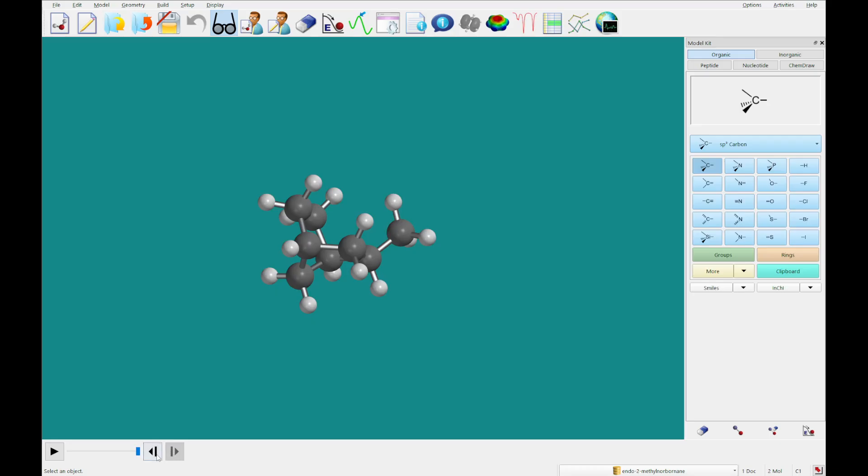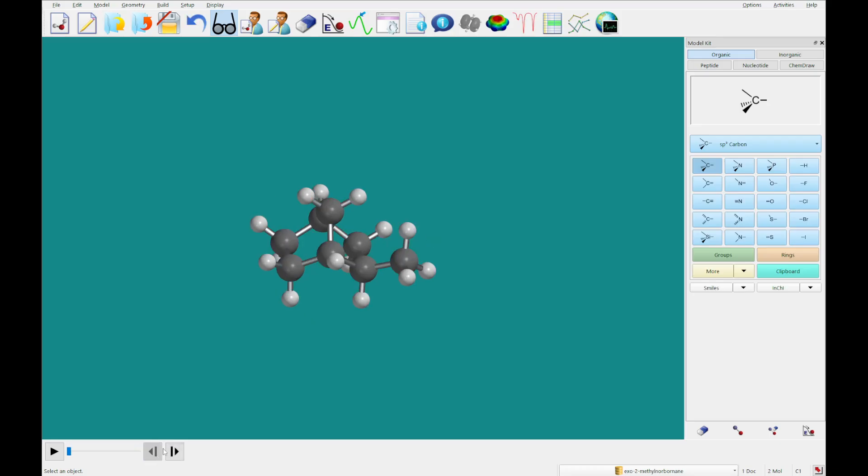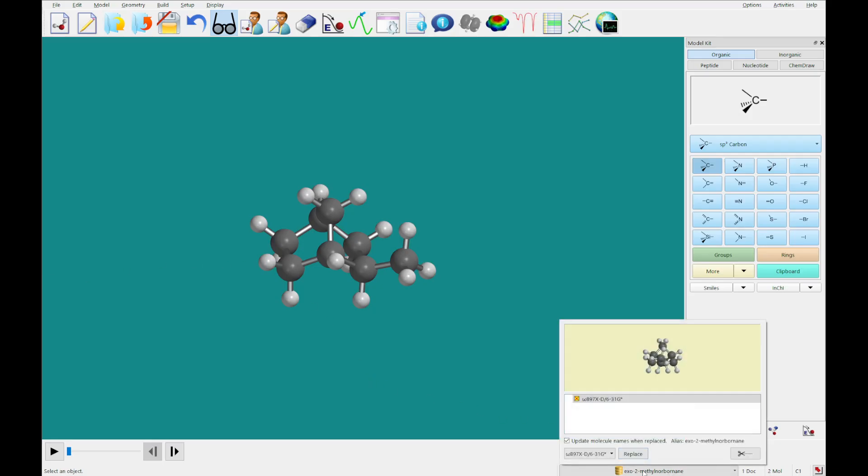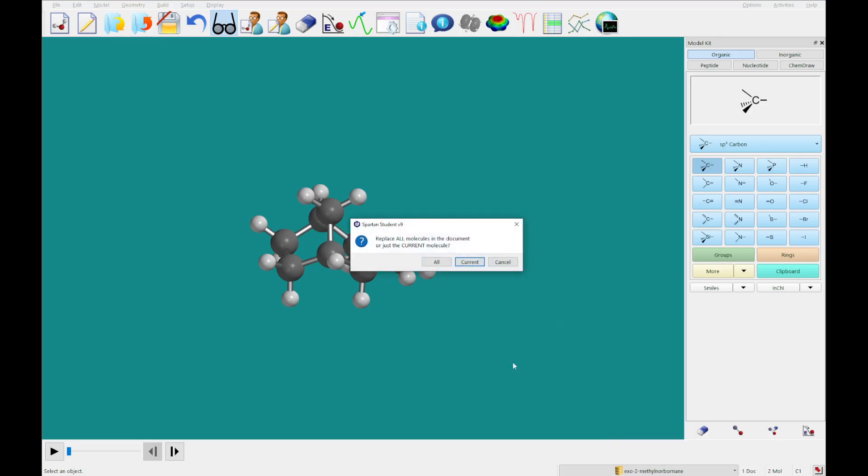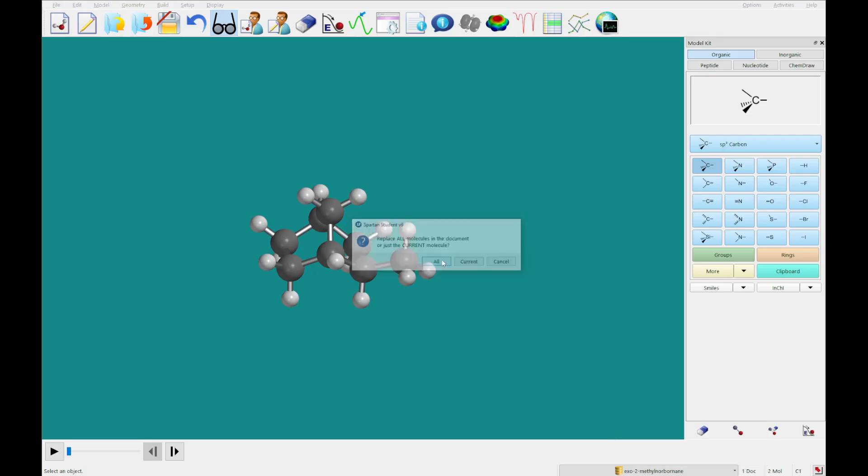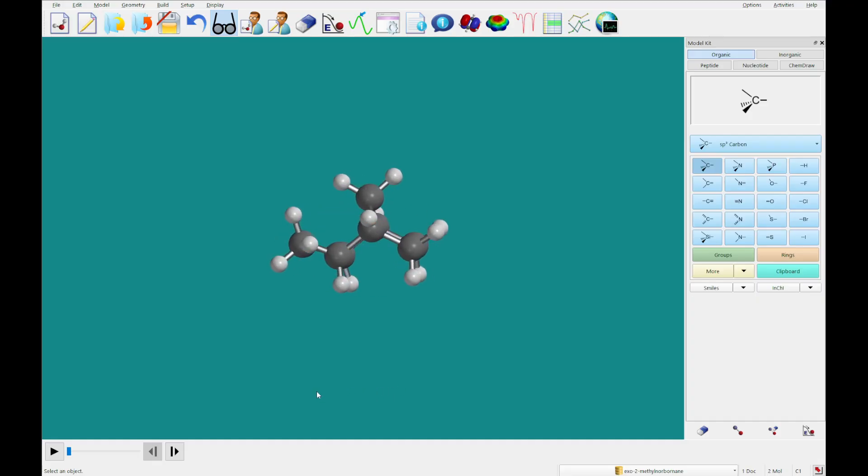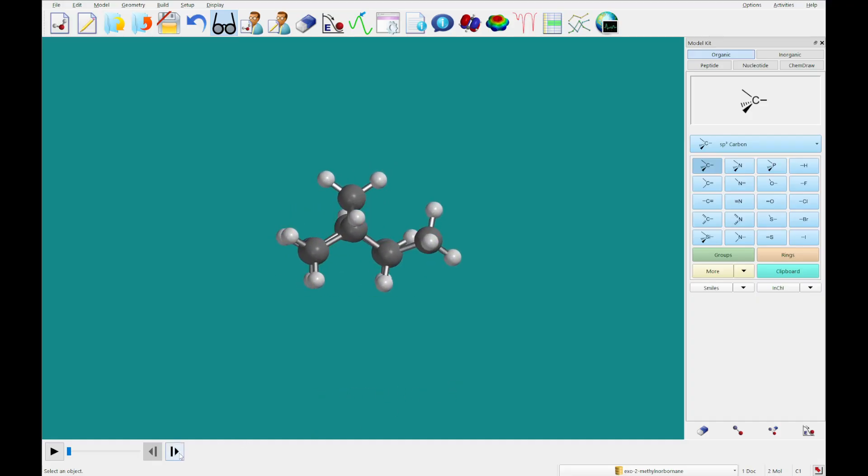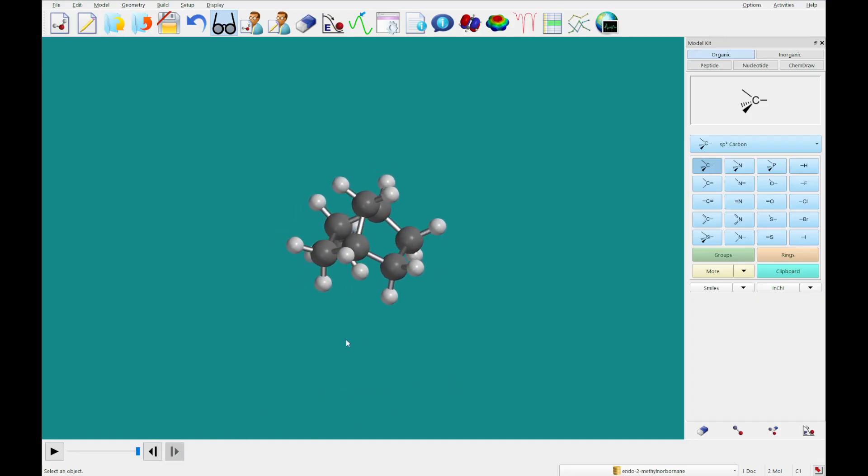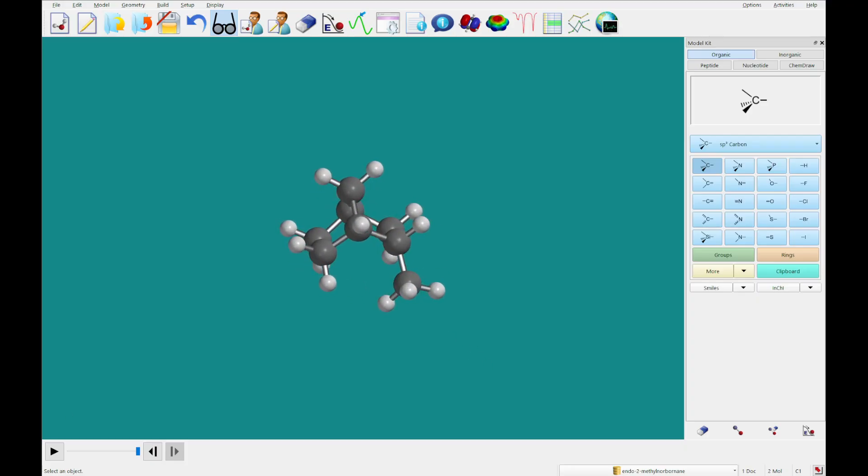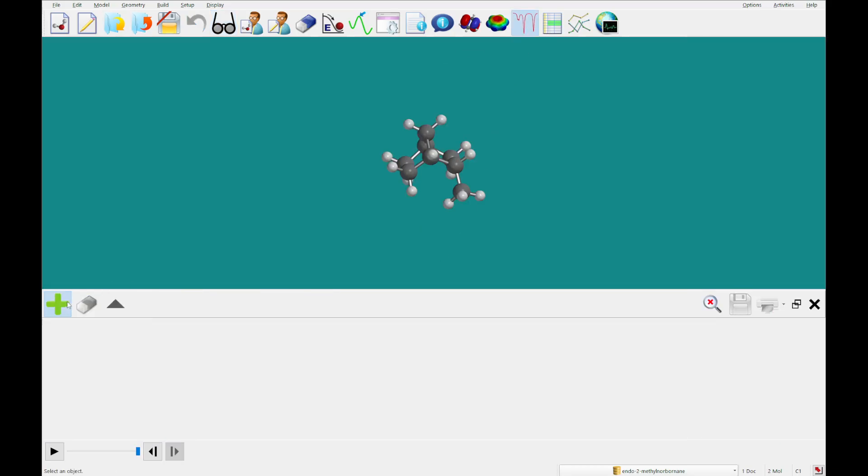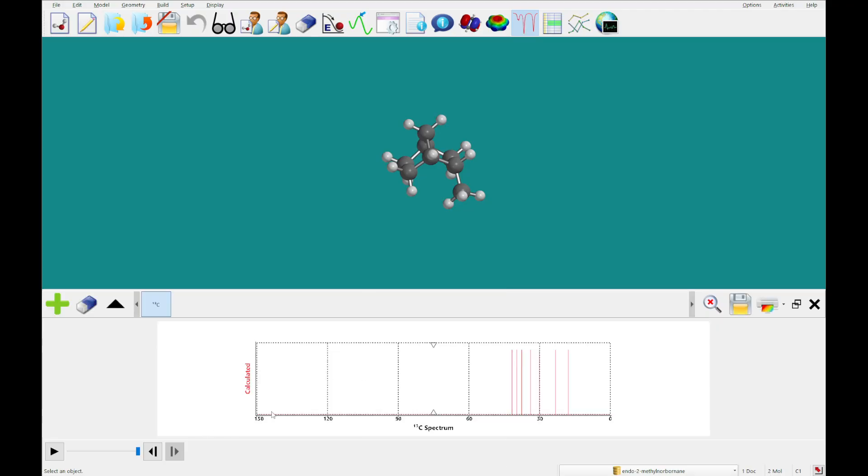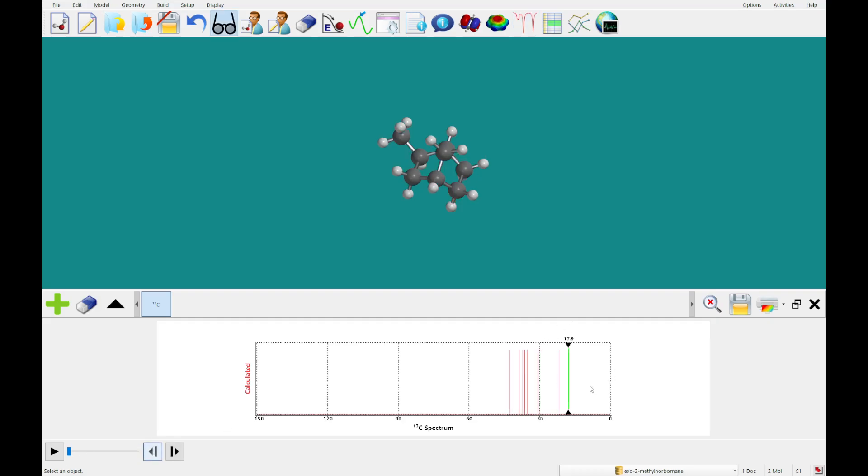Alright, so we've got our exo and endo stereo isomers now. And we are going to click on the name and replace all of them. So both of these will be replaced with the calculated versions from our SSPD. And what we can do is click on the spectra plot and add the calculated NMR shifts. And you can get over to the methyl carbon. And we see a shift of 17.9 there. And on this one, we see a shift of 21.8.